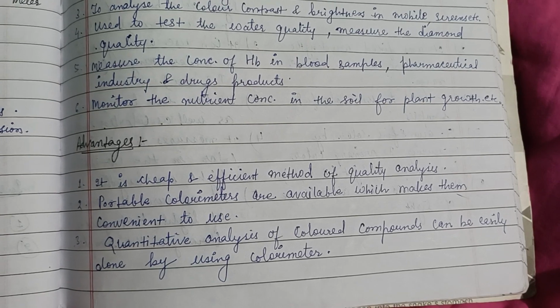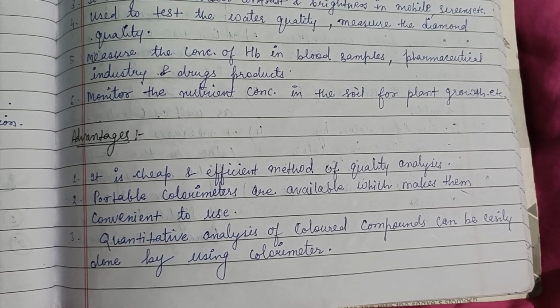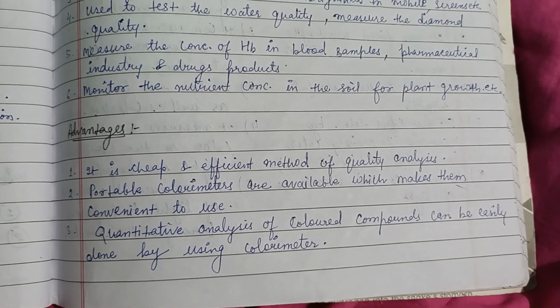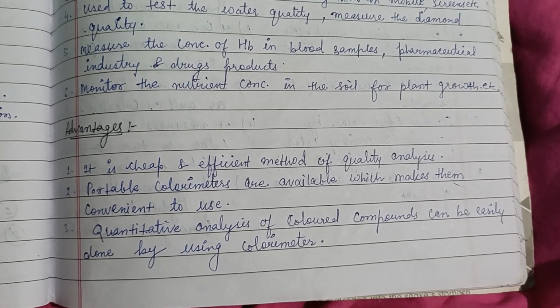Advantages: it is a very cheap and efficient method of quality analysis. Portable colorimeters are available, which makes them convenient to use. Quantitative analysis of colored compounds can be easily done by using a colorimeter.